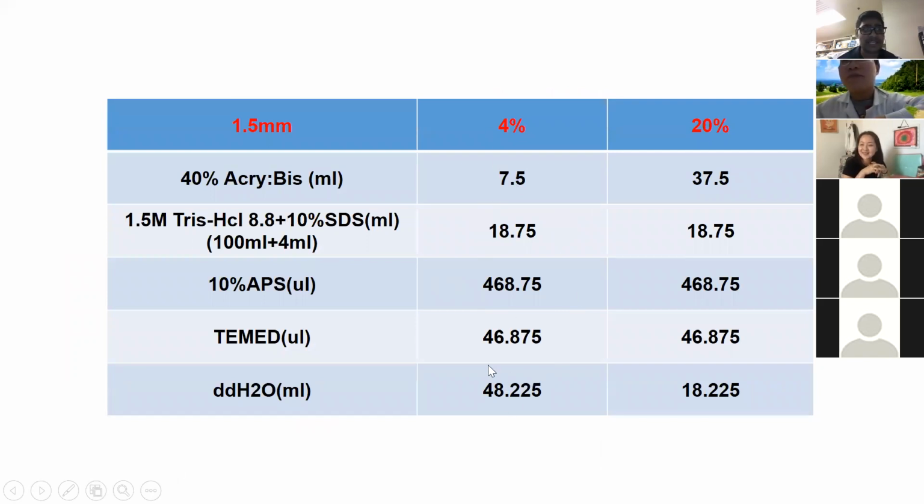I was using these things in my graduate studies actually. So this is wonderful, and we can save a lot of money. If you have enough budget, fine, but that's very costly. It's 10 gels, $120. If you are a new graduate or new trainee, you will have a lot of pressure to use many gels, and maybe the PI is not happy about that.